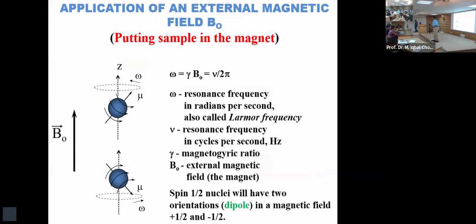Yes. Is it about the shell? The electrons can affect the proton and shape the environment. If we have a concentrated solution with the same compound, can the compound change in this kind of magnetic field?